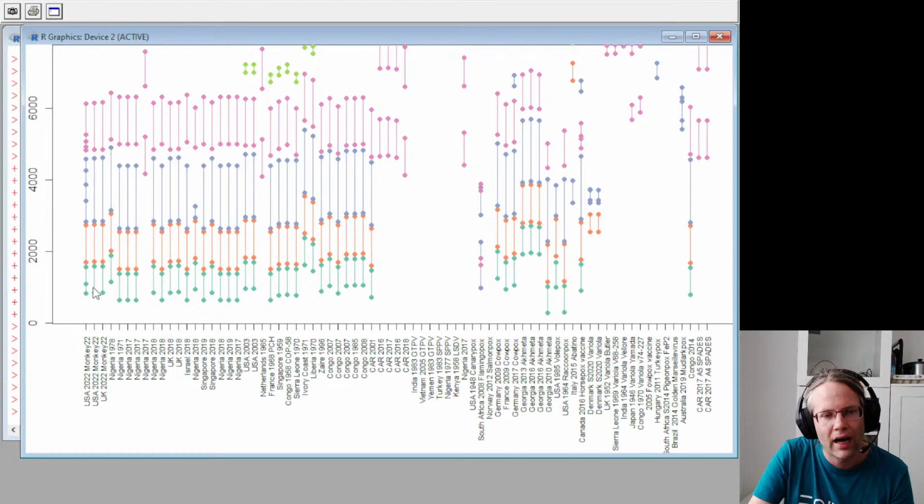So we see that our gene here is actually found, the first one in the USA, and this is probably why they built version 2, right? Because this is version 1 of the genome, so you can see that there are issues, because this protein has multiple stops and ends, so it's not consistent. But this is what I wanted to show you guys.